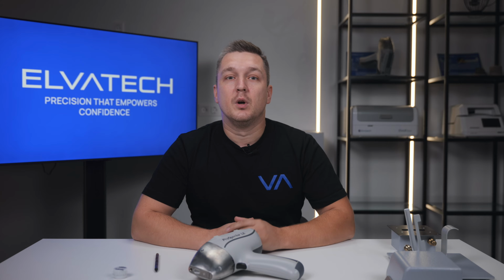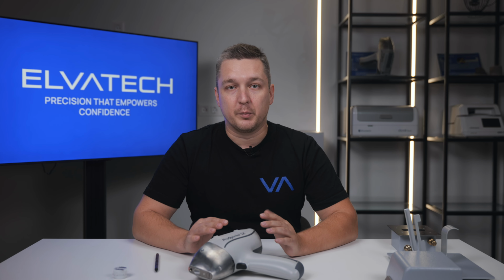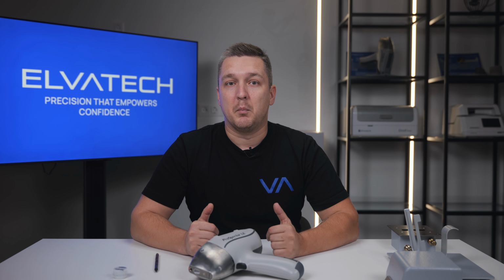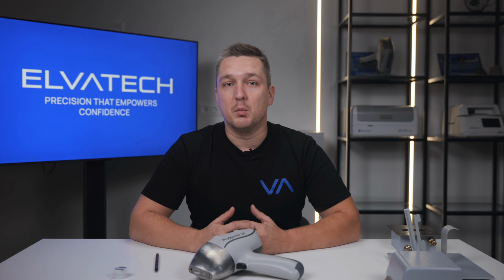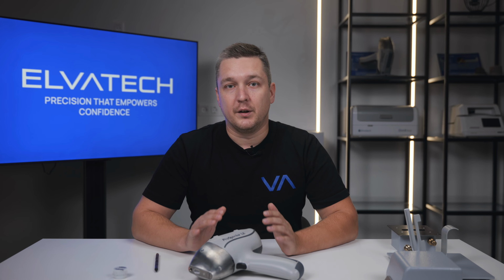In ProSpector 2, this process is automated. You simply set the current price per gram of pure metal for each element you need and enter the mass of the sample. The analyzer then automatically calculates the amount of pure metal in the sample from the measured concentrations and mass, multiplies it by the price you set, and shows the total value of all precious metals in the sample. Instant calculation in ProSpector 2 saves time and removes errors from manual math. No complex formulas or tables, just a ready financial report in a few clicks.